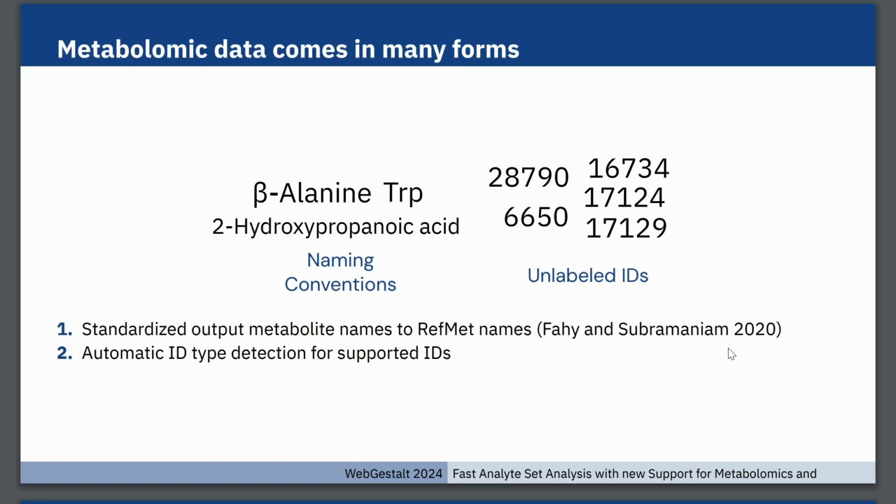And also we find that sometimes metabolite data just gives you IDs without any annotation about what source it comes from. So this is an example from a real study publication I found, where they just gave you metabolites with numeric IDs. And then I looked, there's no annotation. I couldn't tell, is this PubChem? Because PubChem is numerical. ChEBI is also very similar. And so that's another problem. We can't really solve this naming convention, as that is very specific.